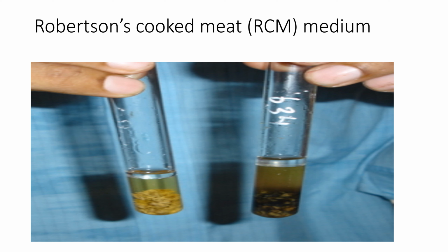Beta, see, this is a diagram which shows a test tube with meat particles beneath, and there is a broth, and this upper light layer is the liquid paraffin, which is creating an anaerobic environment by sealing the surface so it does not get exposed to oxygen, right? So this is the picture showing the Robertson cooked meat media.